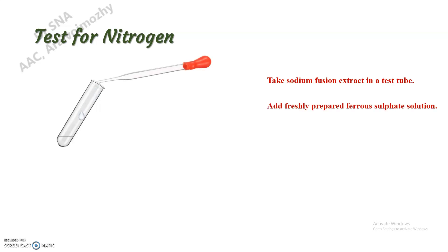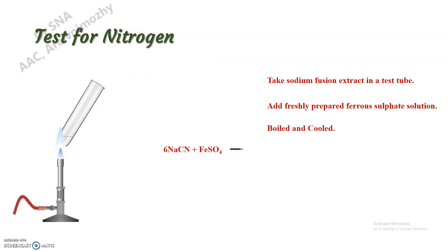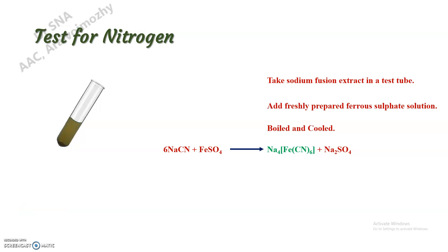First, the test for nitrogen. Take a small amount of this sodium fusion extract in a test tube, add freshly prepared ferrous sulfate to this, and boil it. After boiling, cool it and now add concentrated sulfuric acid.